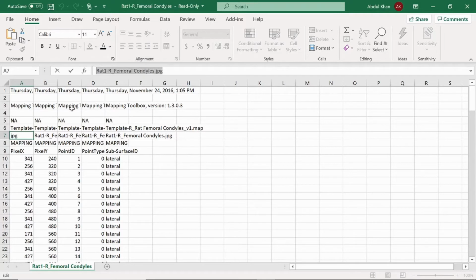The next row entry is the category of the characterization. The software uses the name of the category for some advanced functions and to group related characterizations. As you can see, the category for the first 5 columns is mapping, with uppercase letters. The next row entry is the name of the characterization and units. Any format can be used for this name, however, it is highly recommended to use standardized name using the following format.